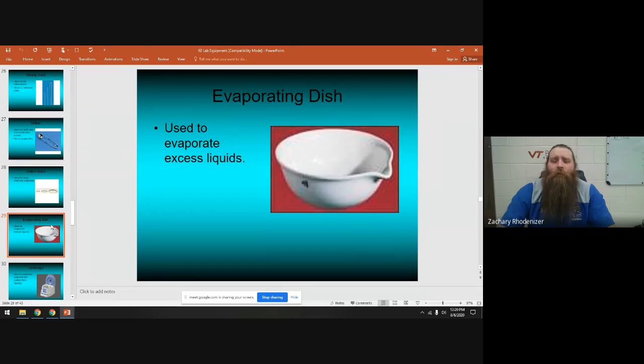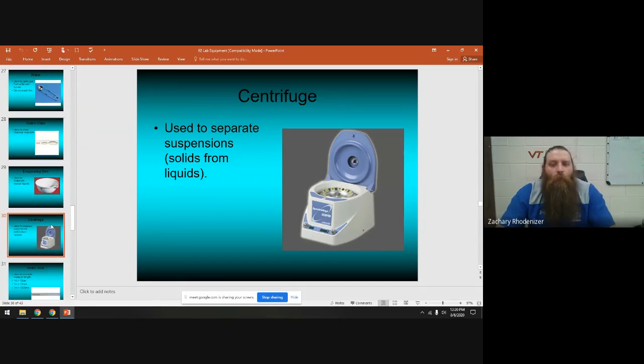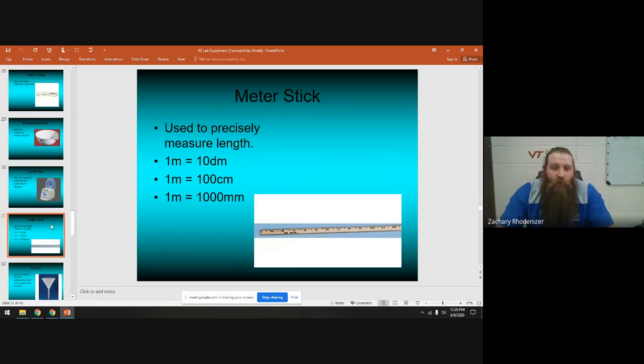An evaporating dish is used when you have a lot of liquid to evaporate — it's deeper than the watch glass. A centrifuge is not something we use in chemistry, but it's a common lab tool used to separate suspensions — we'll look at them but won't use one in the lab. Meter sticks are used to measure distance and length. Remember: one meter equals 100 centimeters, 1000 millimeters, or 10 decimeters.